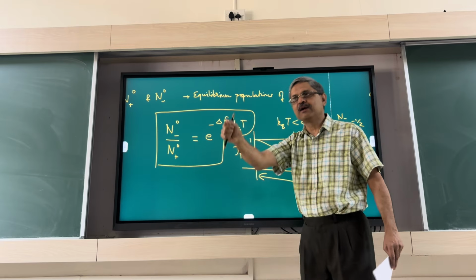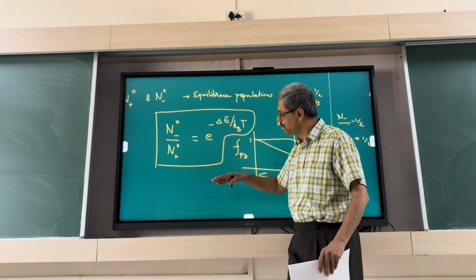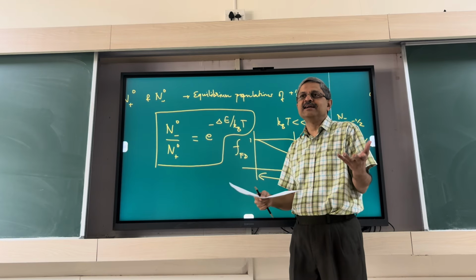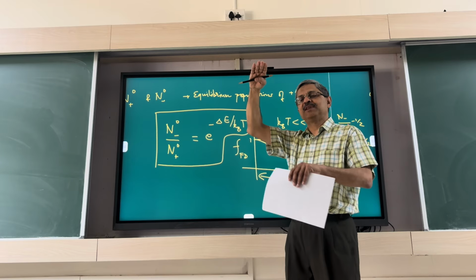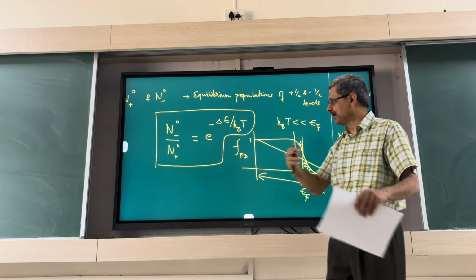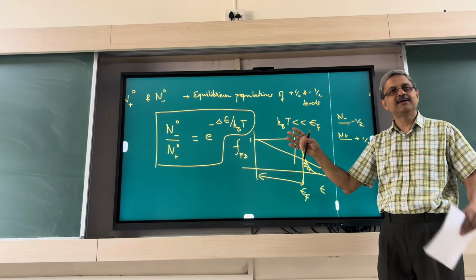But if you apply an RF field, you are externally driving, so you can pump nuclei from the ground to the excited state. It's a transient thing, but if you apply RF long enough, everything will be in the excited state.